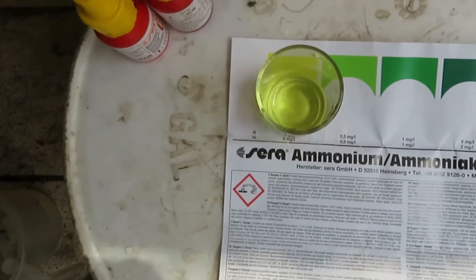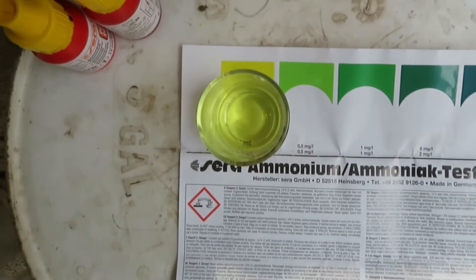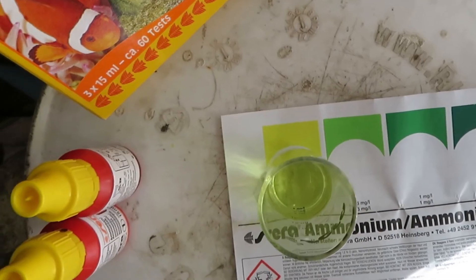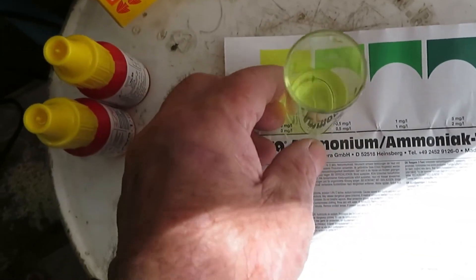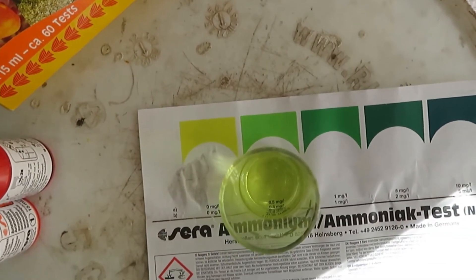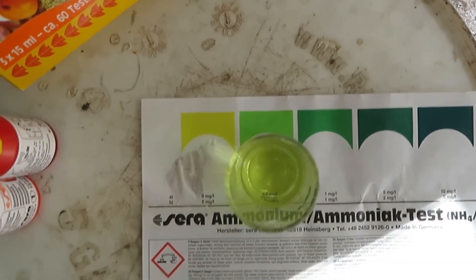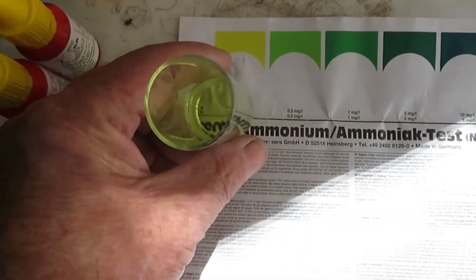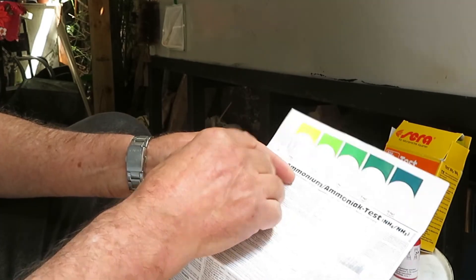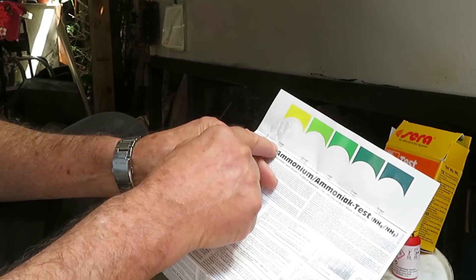Comparing our sample to the chart, we can see it has a yellowish colour with a very, very slight greenish hue. However, if we hold it over a different area, the colour looks absolutely different — no comparison. So the result must be somewhere in between those two colours on the chart.